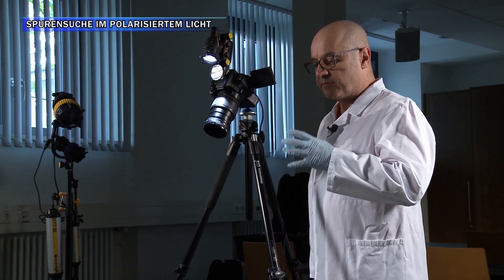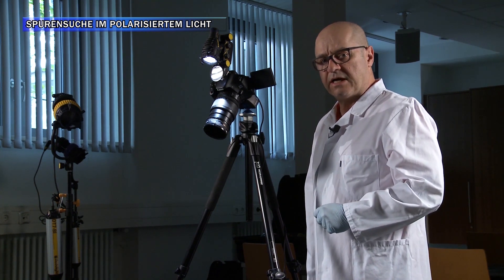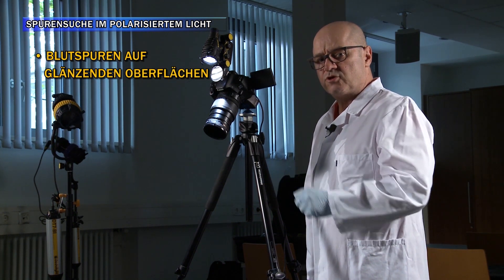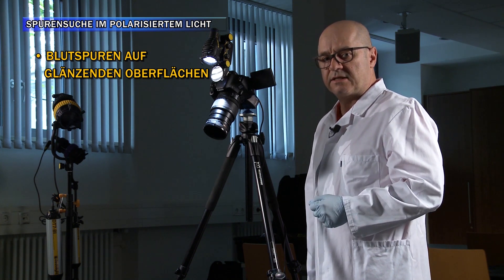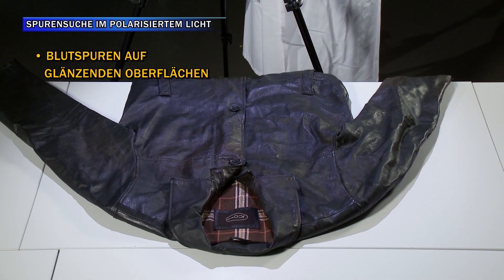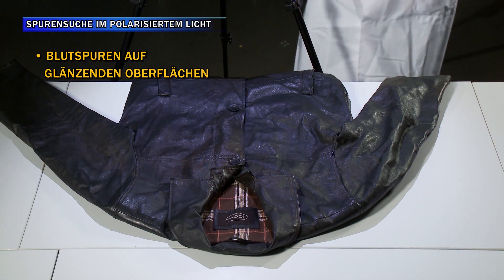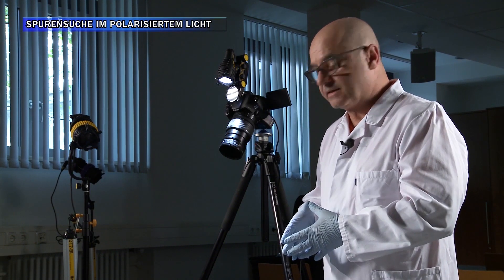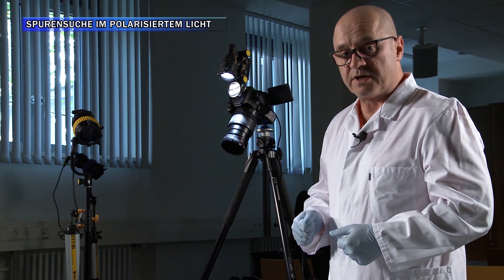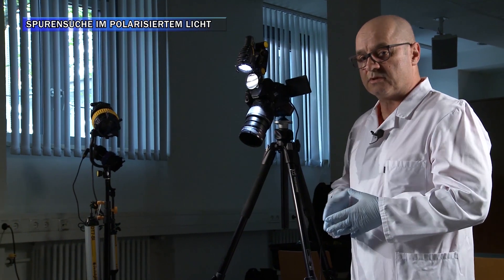Wie Sie sehen konnten, ist es mit dieser Technik möglich, auf so einem Problemmaterial Blutspuren sauber, detailreich und kontrastreich darzustellen. Mit der Möglichkeit, noch ein bisschen die Farbtemperatur zu wählen, ist es möglich, das Bild zu optimieren. Das heißt, die Möglichkeit ist jetzt gegeben, zum einen die Spur gezielt abzunehmen, zum anderen sie morphologisch bezüglich einer Rekonstruktion zu beurteilen.